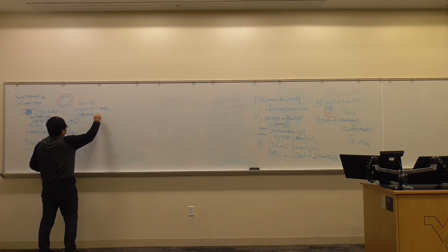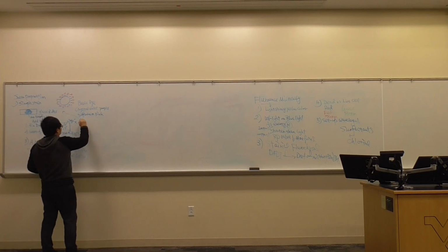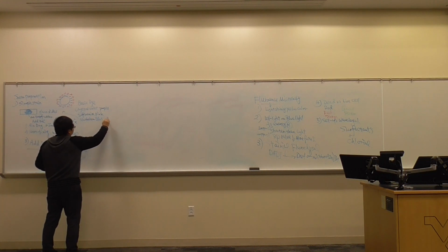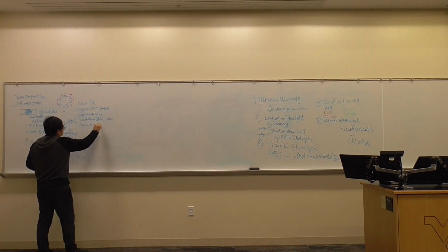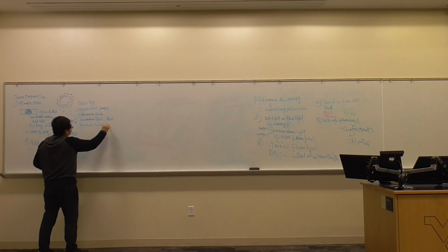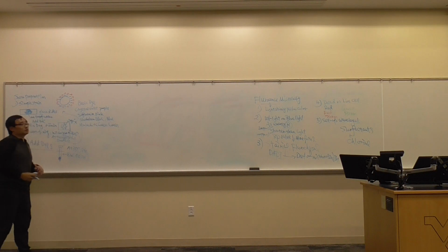This is a pink color. We also could use methylene blue. It's a blue color shade. We also can use malachite green. It is a green color, obviously. This is showing you what the colors look like.